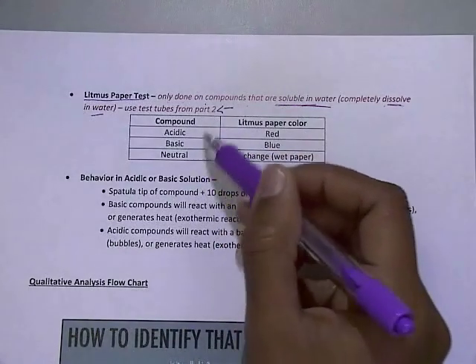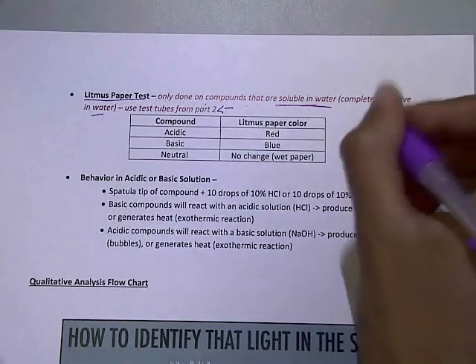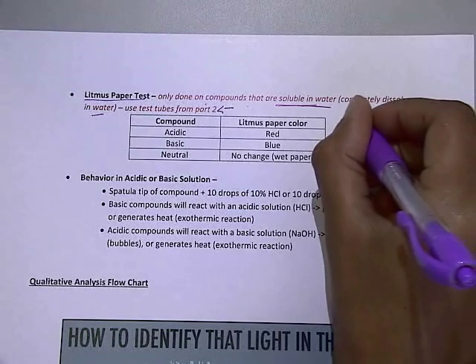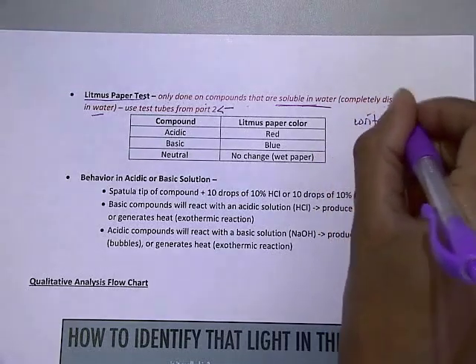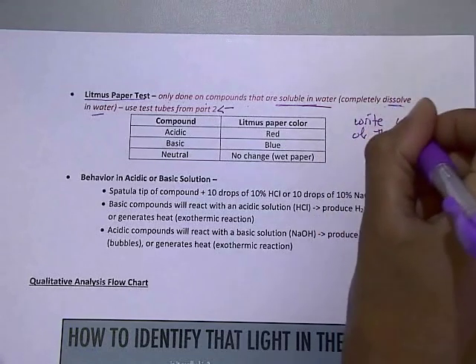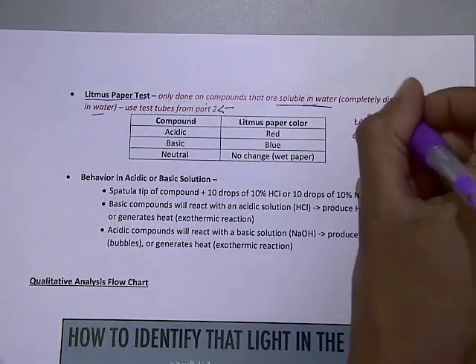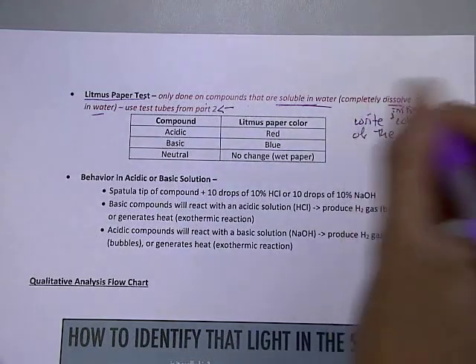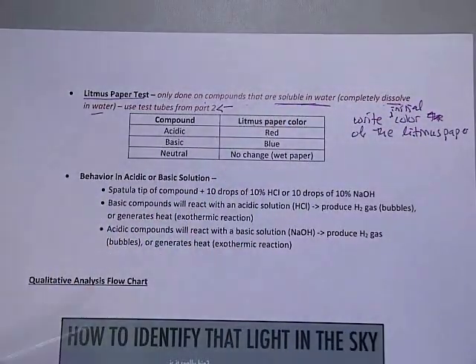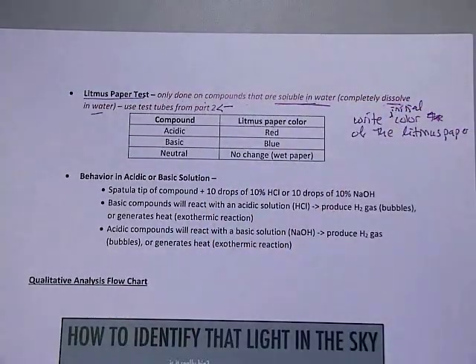So, an example of a setup. First of all, I want you in your lab notebook to make observations of the litmus paper. For example, for the litmus paper initial observations, I want you to write the initial color of the litmus paper. But in your lab notebook, I also want you to write the result of the color that you get when you put it into your soluble compounds in water.